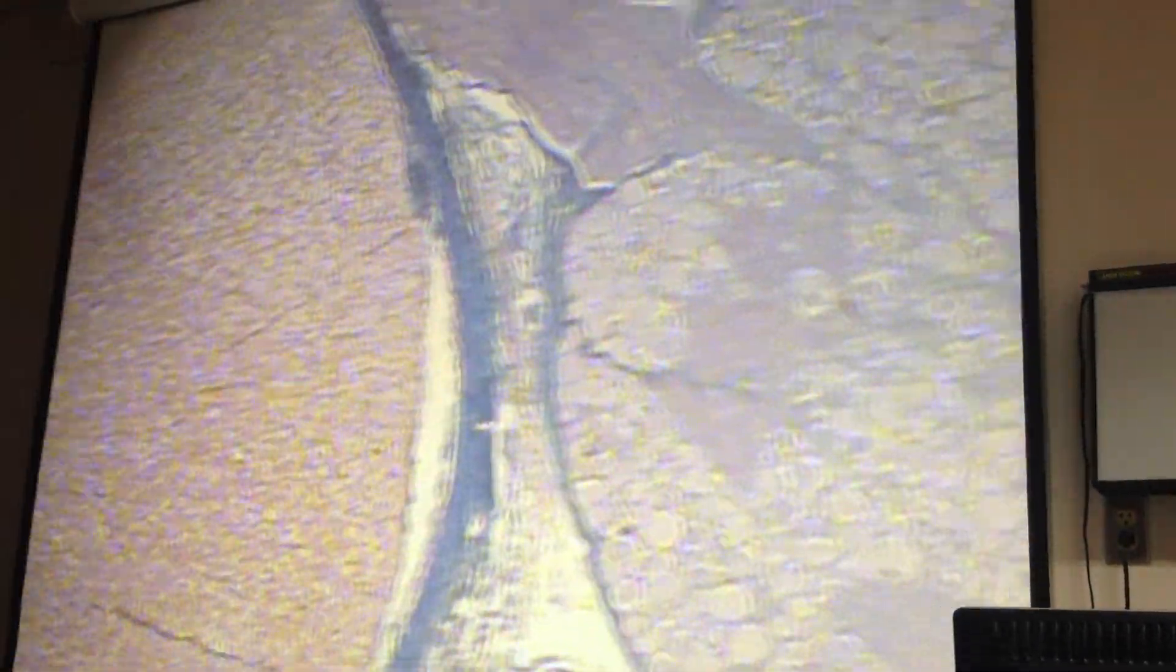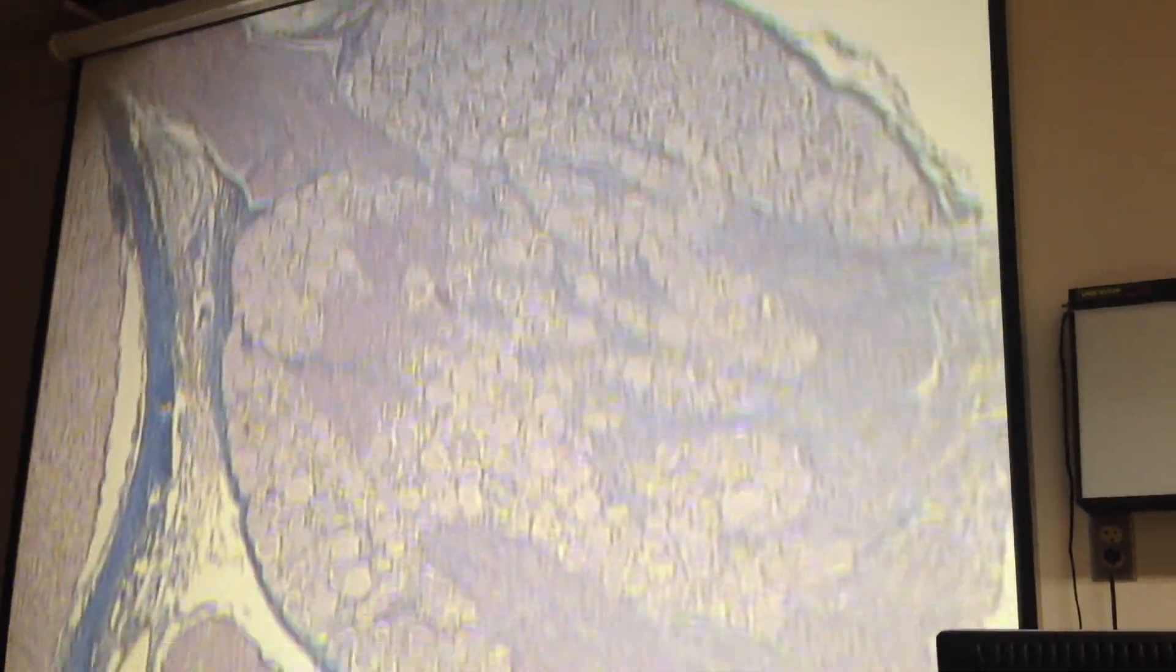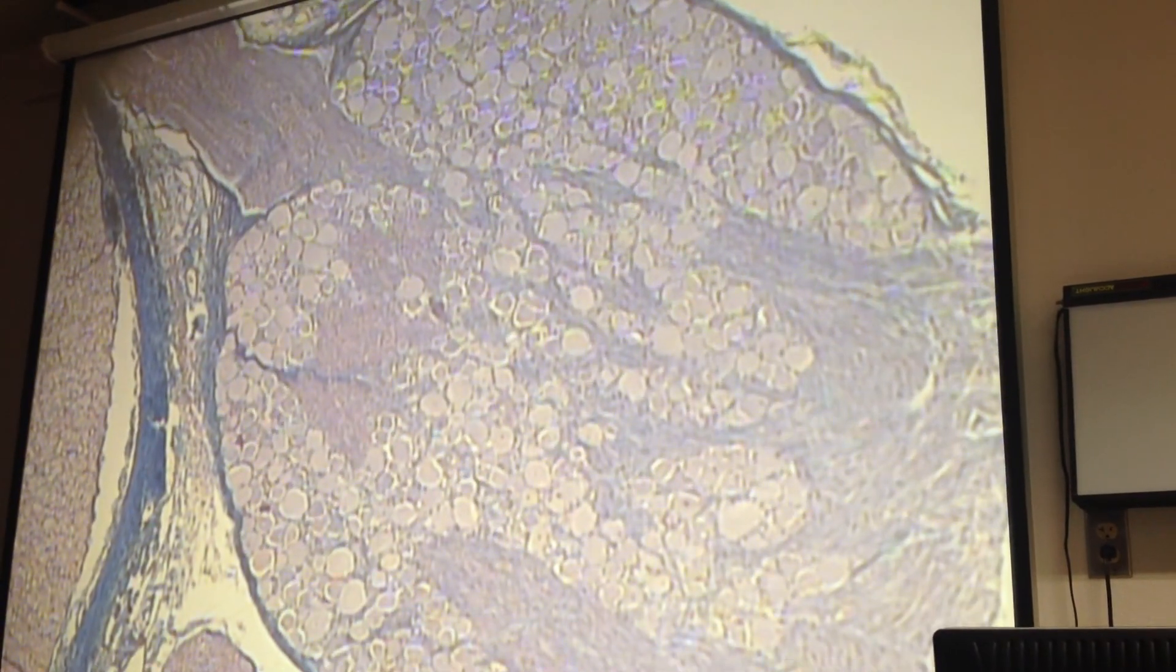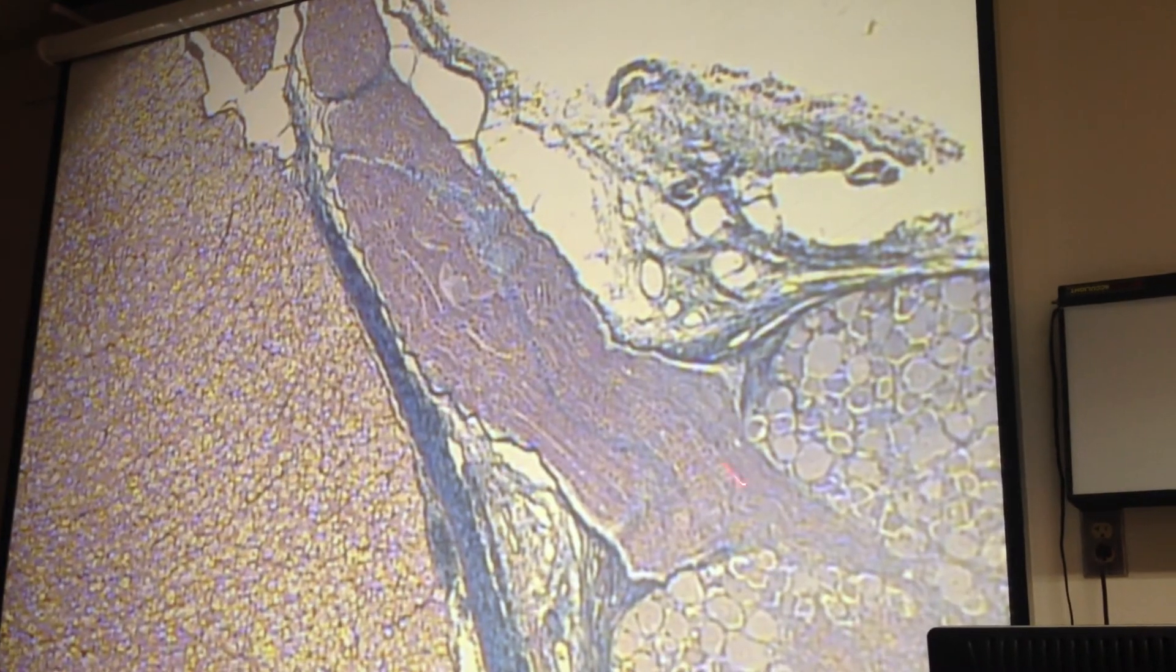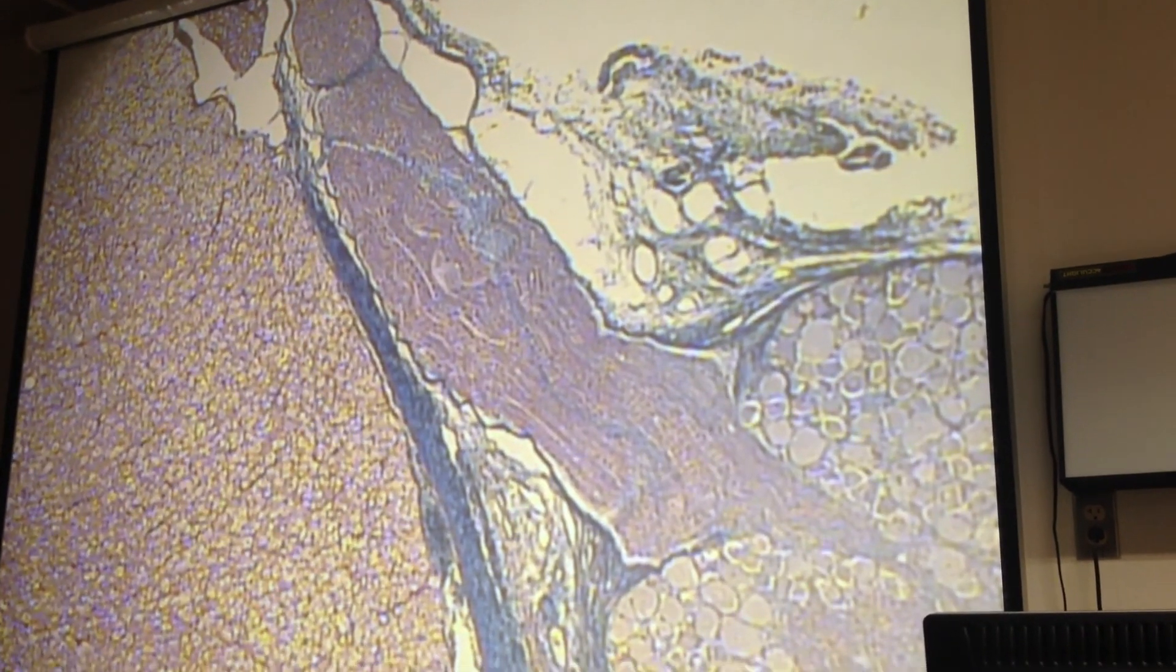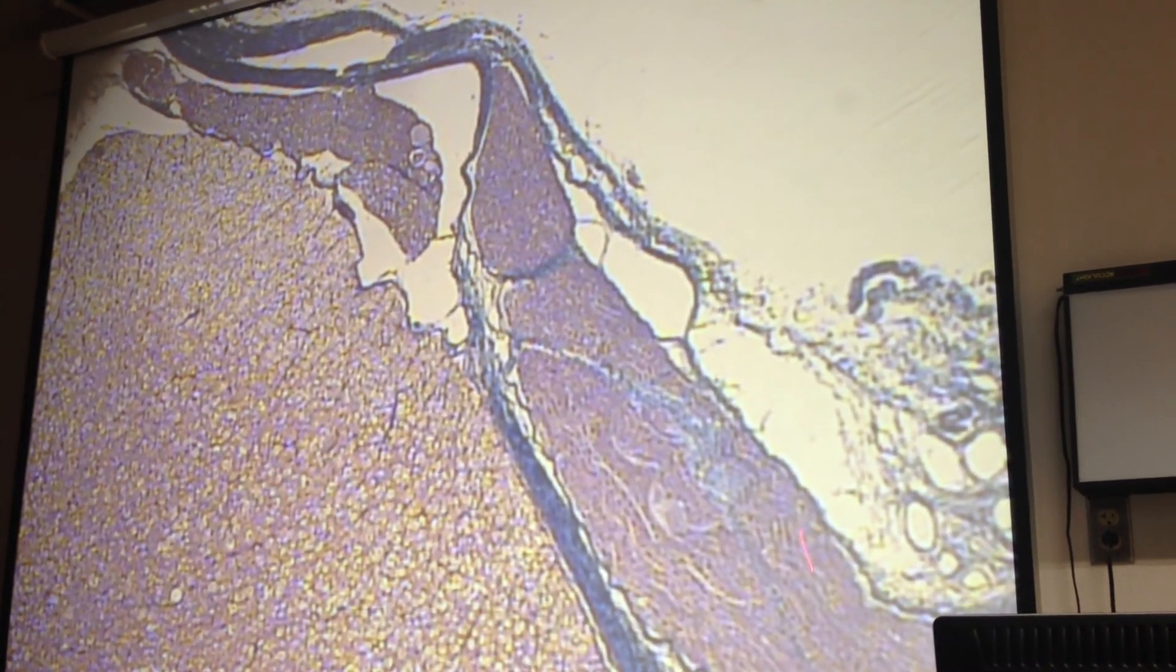Okay, so let's do the hard stuff first. So out here, I went lateral. And so there's this large sort of circular thing, and it's connected to these. So we said this was anterior, so if I go back, there's my posterior median sulcus right there, and I go lateral from there.